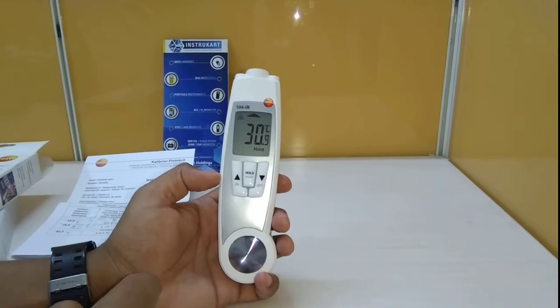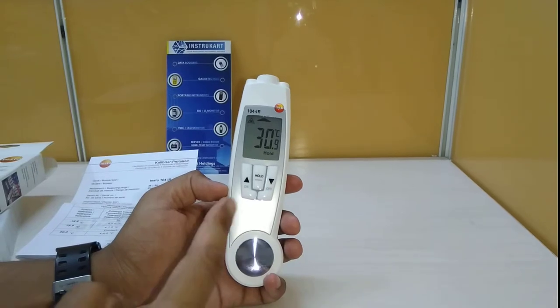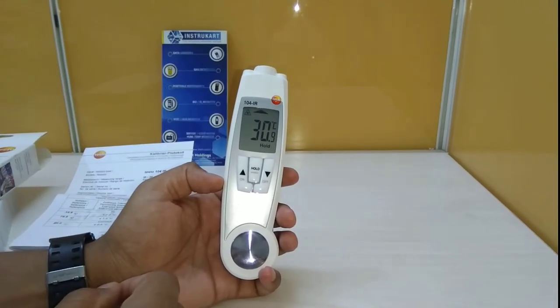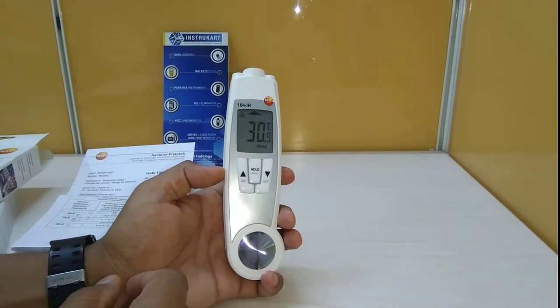Hello and welcome to InstruCart Holdings, your worldwide instrument partner. We have an infrared temperature monitoring device which is handheld, and this is from Testo, the model being the 104 IR.